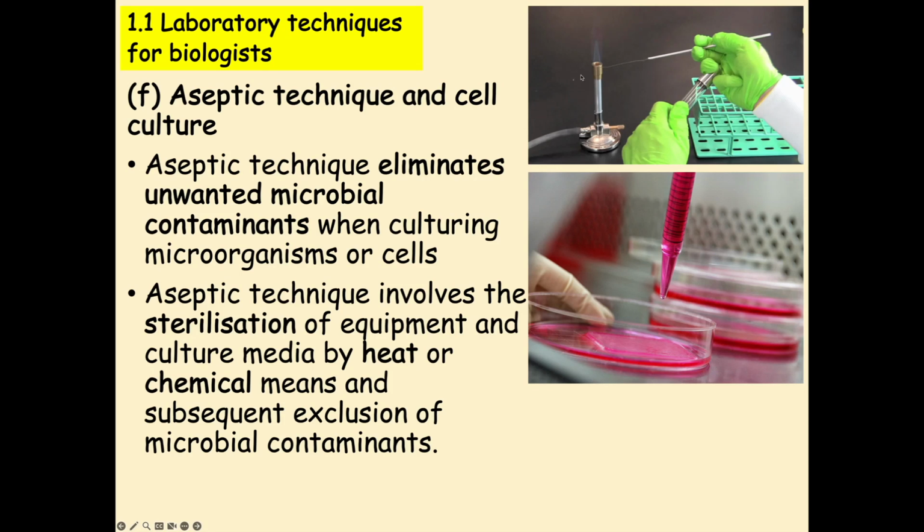So we're using heat here. Now, the heat is good because we can use that on the inoculation loop, which we use to transfer our pathogenic organism that we're moving about. And we can also use that heat to help sterilize the air. We'd probably use some sort of antiseptic spray all over the desk and the other equipment as well.